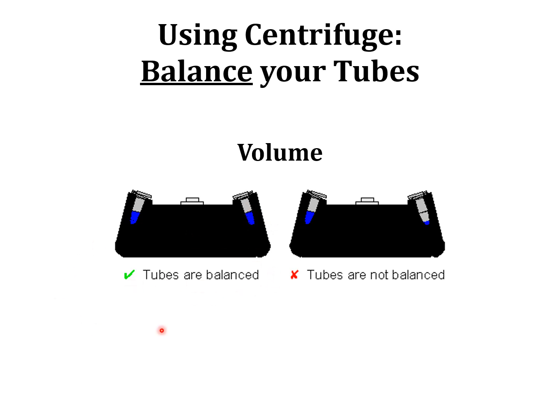These tubes are balanced. However, here on the right, these tubes are not balanced because here, let's say 300 microliters, and here we have maybe 20 microliters. So if we put this in the machine, this will damage the machine, because these tubes are not balanced by volume.